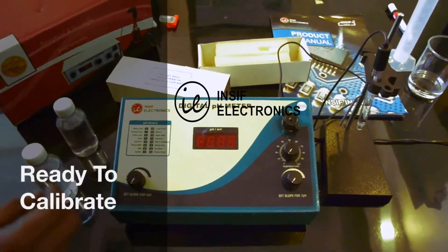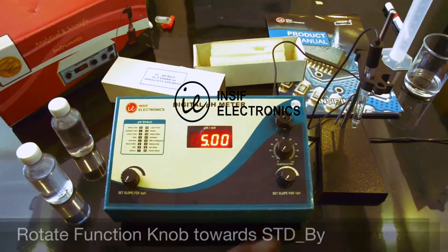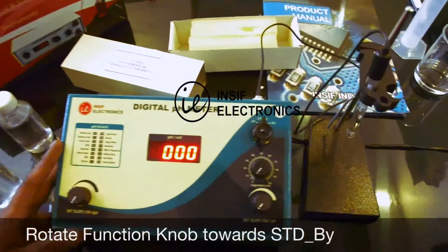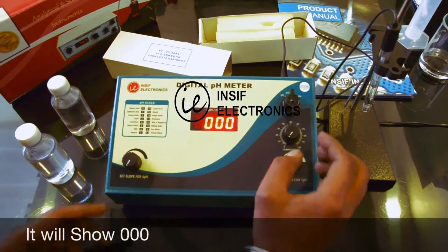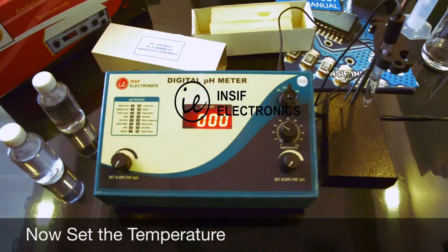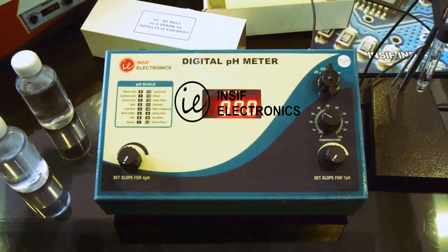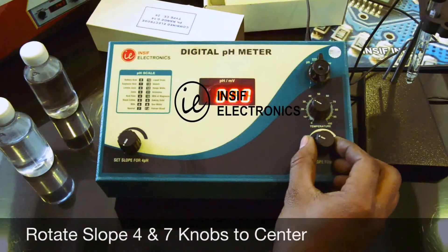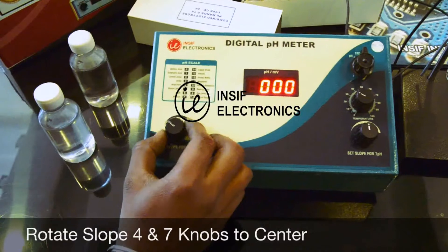The digital pH meter is ready to calibrate. Switch on the instrument and rotate all the knobs to the extreme left position. On the top right hand side we have the function knob — rotate it to the standby position, which is center 1, and the display will show 0. Now rotate the temperature knob to the temperature of the solution, then rotate the slope for pH 7 knob and the slope for pH 4 knob each to their center position.